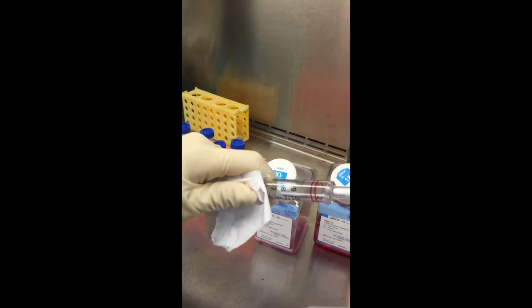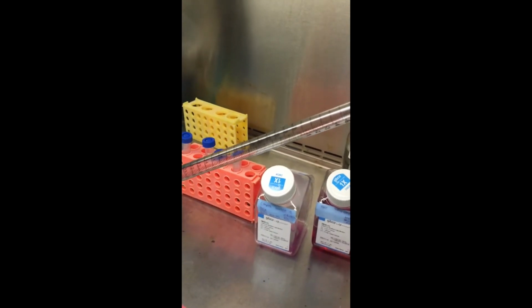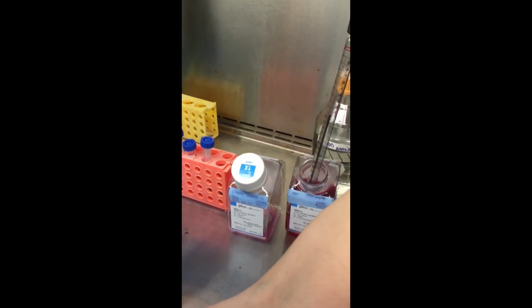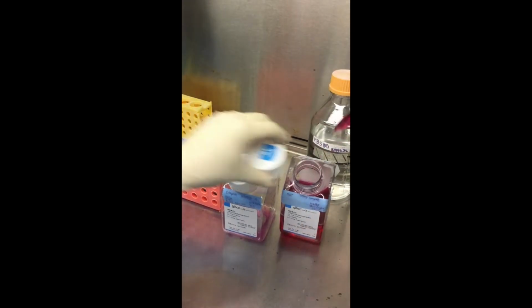Okay, so for the next 2, I'm going to pull the volume for both of them up in here. So I'm going to take 16 and then just let out 8 at a time. Try and do that whenever possible so we can save pipettes. And the trick is just to let it out really slow by not holding the button down quite as hard. And then you'll be able to read the numbers just fine. There we go.